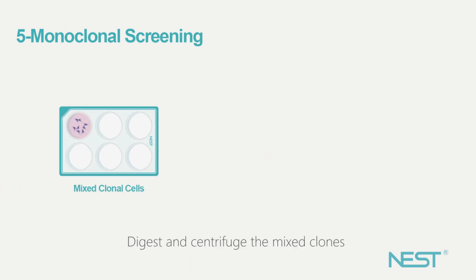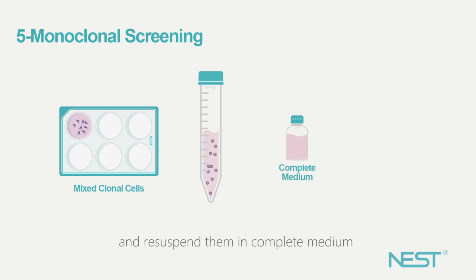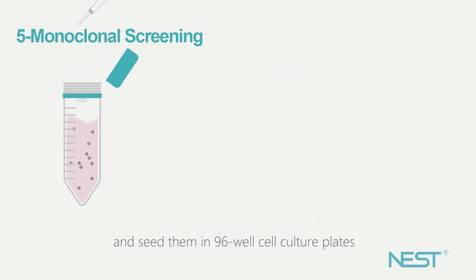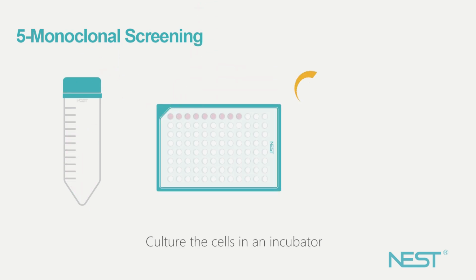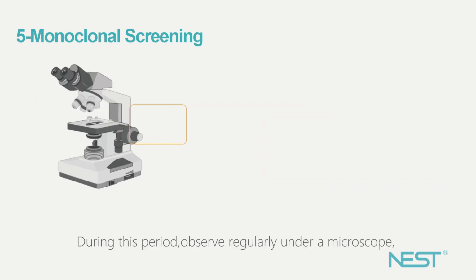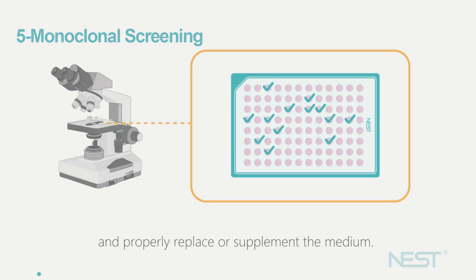Digest and centrifuge the mixed clones, discard the supernatant, and resuspend them in complete medium, then count them. Dilute cells to a concentration of 8 to 10 cells per milliliter with complete medium. And seed them in 96 well cell culture plates at the amount of 100 microliter per well. Culture the cells in an incubator with 5% carbon dioxide at 37 degrees Celsius for 2 to 3 weeks. During this period, observe regularly under a microscope. Mark the wells in which monoclonal cell colony grow, and properly replace or supplement the medium.